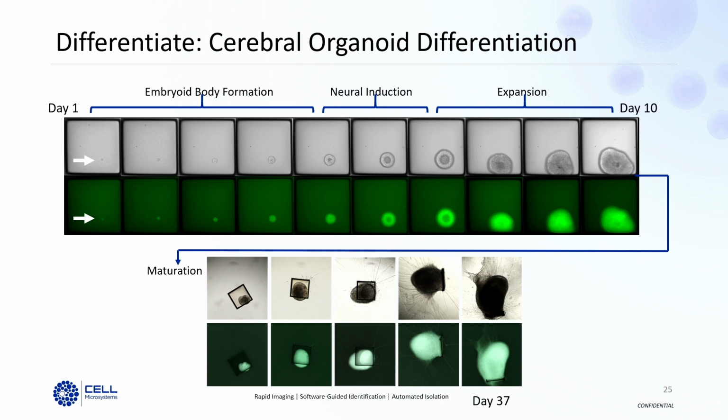And then the second part of your question was what happens to the raft? Yeah. That's also organoid dependent. The short answer is nothing. The long answer is I have seen that some organoid types really do have a cell to polystyrene bond with the cell raft. Other organoid types are sort of just using that ECM as a loose attachment to the raft. So what that means is that downstream in the 96 well plate, sometimes the raft stays with the organoid, like you can see here.